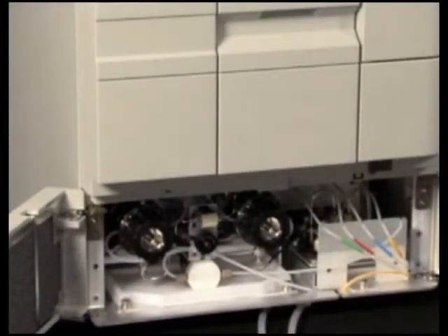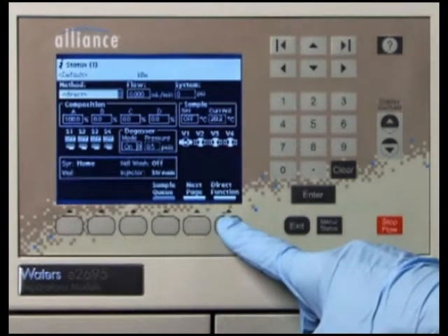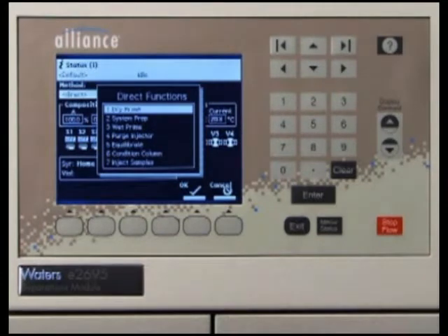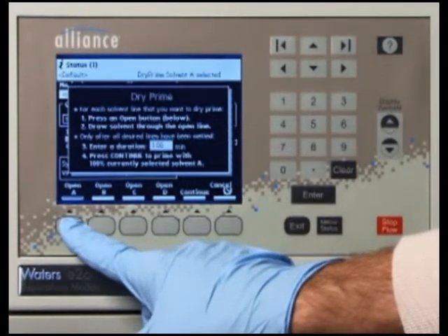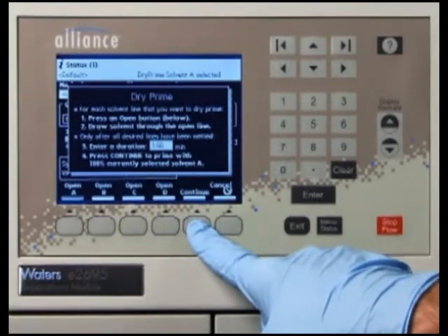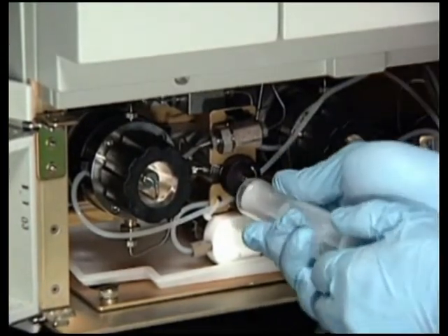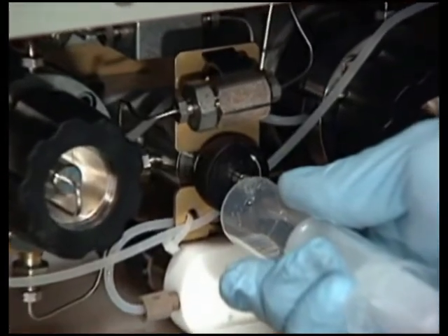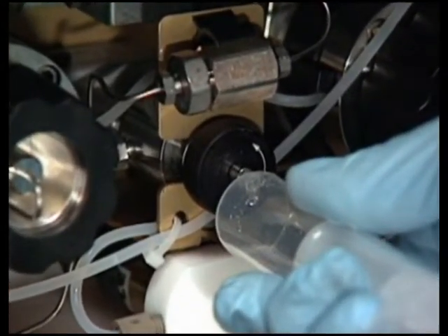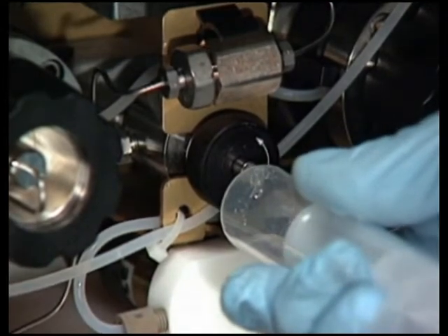To prime the solvent management system, you will need to perform a dry prime. Begin by pressing the menu status key to enter the status screen. Press the direct function screen key and the direct functions menu appears. Select Dry Prime, then press OK. The Dry Prime dialog box appears. Press the screen key corresponding to the solvent line you want to prime, then press Continue. Next, open the vent valve and insert the priming syringe. Withdraw the syringe plunger to pull solvent through the tubing. You may need to exert force to pull the air and solvent through the system. Continue until you pull all the air through the solvent line into the syringe. Repeat the dry prime for each solvent line you want to use, then close the prime vent valve.